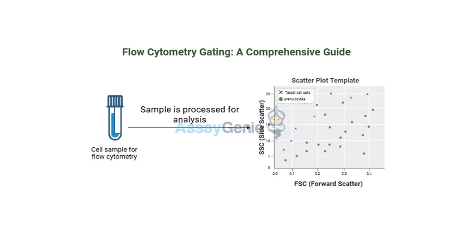And within those groups, we can even look for other markers, like activation markers, to understand how those T cells are acting, what they might be doing. So it's like analyzing their fingerprints, looking for weapons, any evidence that can help us understand what they're up to. Exactly. Sequential gating helps us break down this complex network of cells step by step, and then we can see how the different players are related. It's like we're creating a family tree for ourselves.